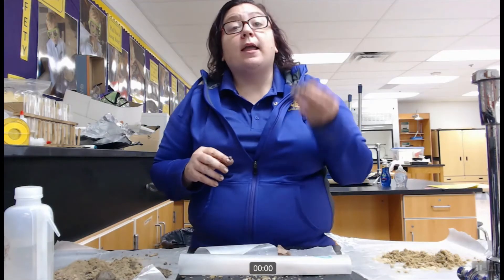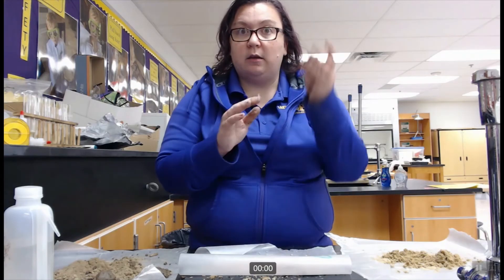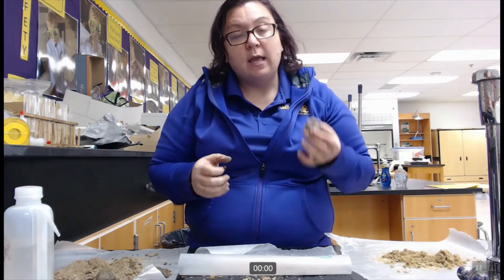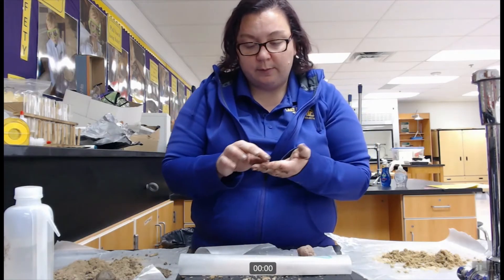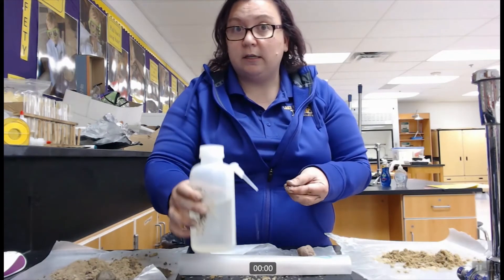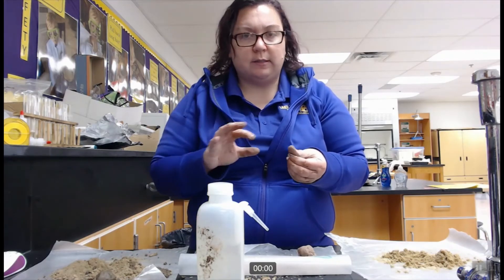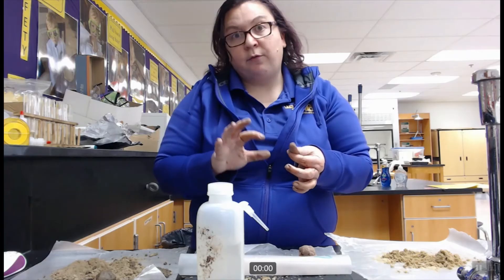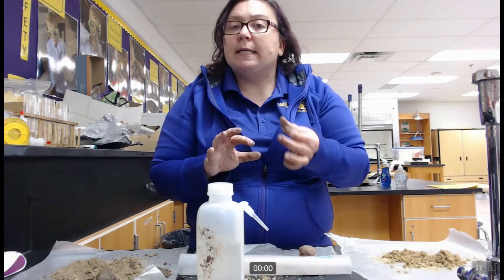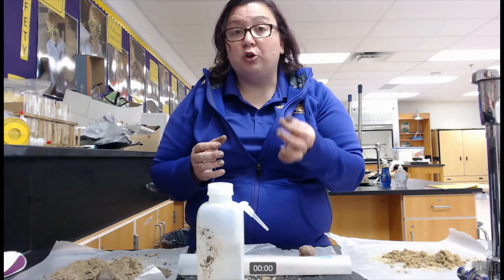So with my second sample so far: I can hold it in a ball shape and I make a strong ribbon that is about eight centimeters long. The final test is to take a small sample, really wet it, and feel whether it is smooth, gritty, or neither. A very silty soil — your hand really just slides over and I am not feeling any grittiness, but it is not super smooth. So it is neither gritty nor smooth.